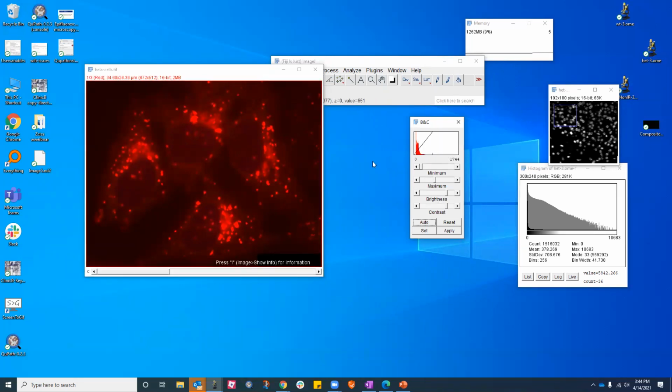It only changed the first one, not the second and the third one. And you can appreciate that most of our values for the green channel are right here, right? If we go to red, if I go to blue, most of my blues are right here.